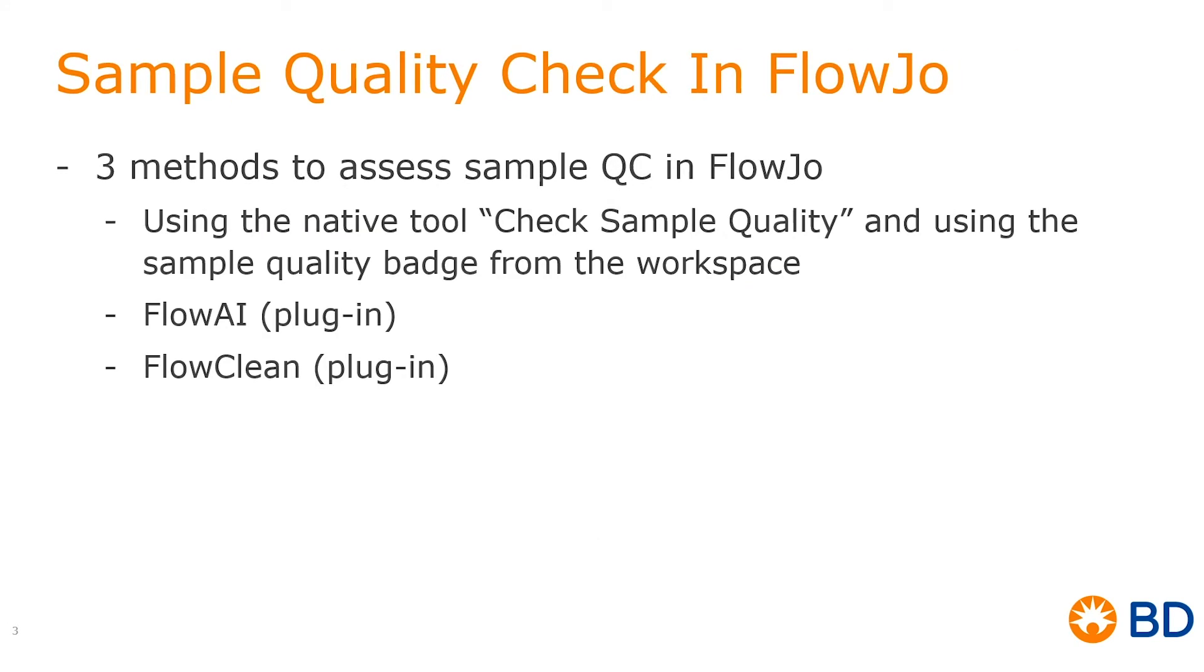In FlowJo, we have three methods to do just that. The first one would be to use the native tool, check sample quality, and then use the sample quality badge from the workspace.